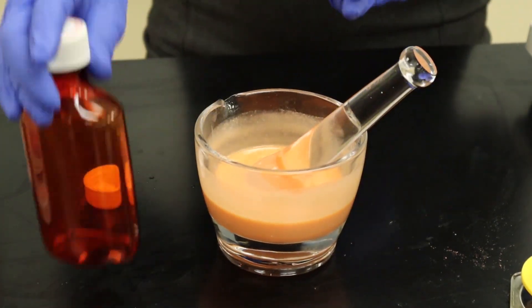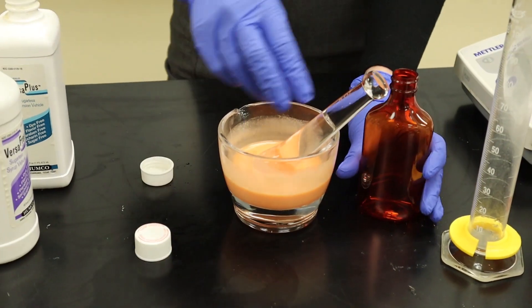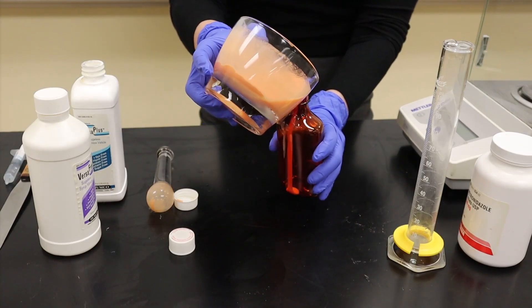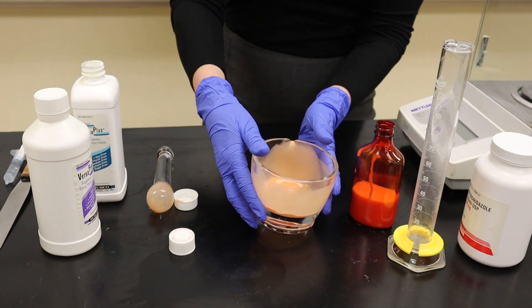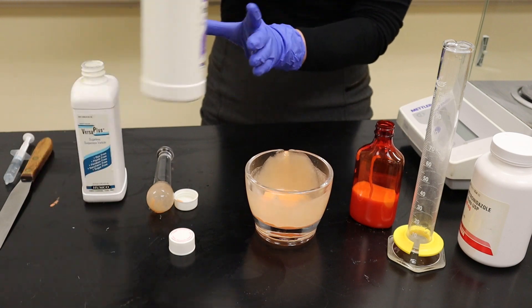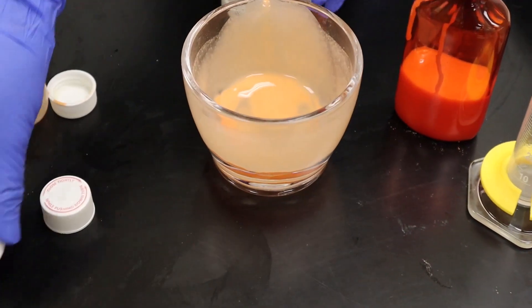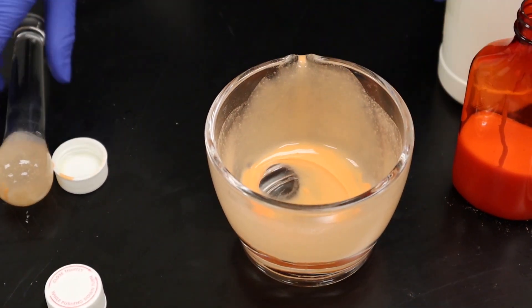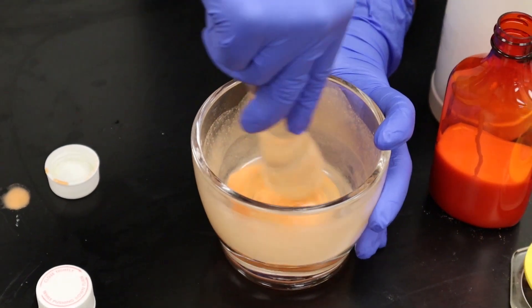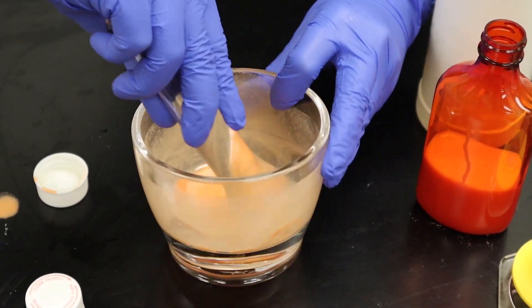Now that I have my powder suspended I'm going to transfer it into my calibrated amber bottle. I'm going to use my VersaFree to wash out my mortar and make sure that I get all of the powder incorporated into my suspension, and then I'm going to use it to QS up to my 150 ml in my amber bottle.